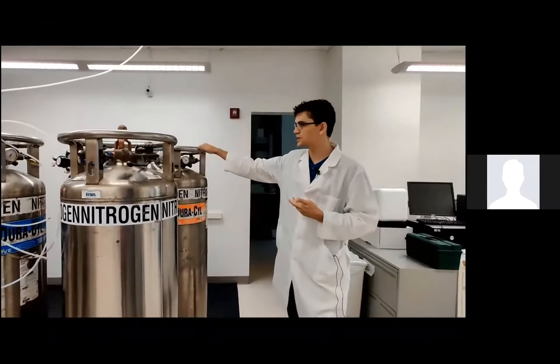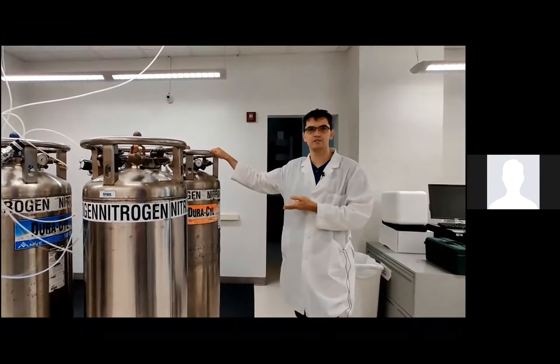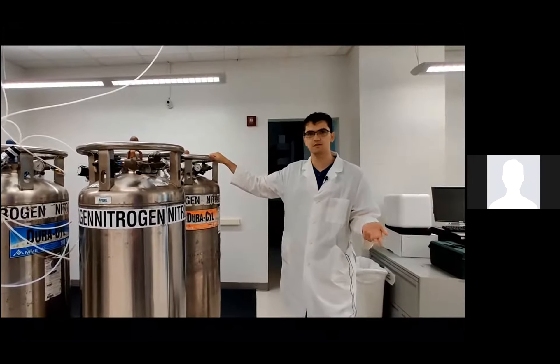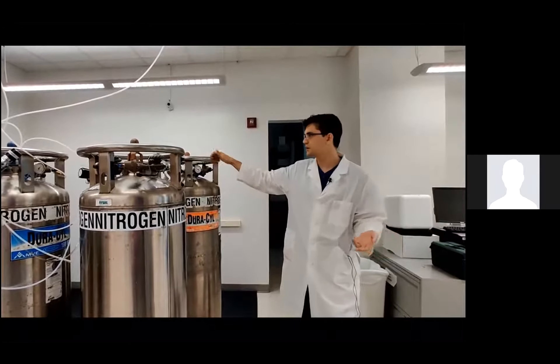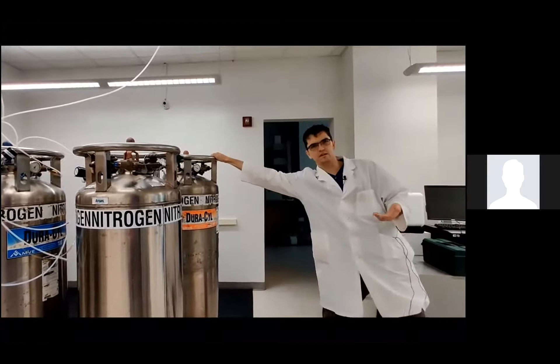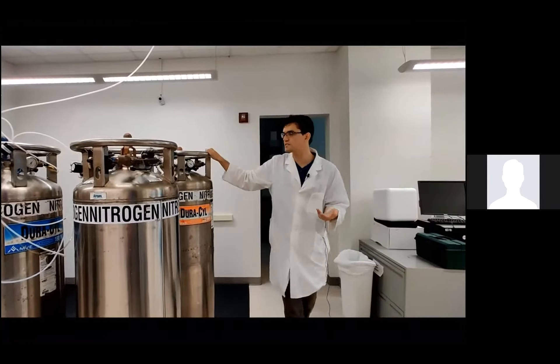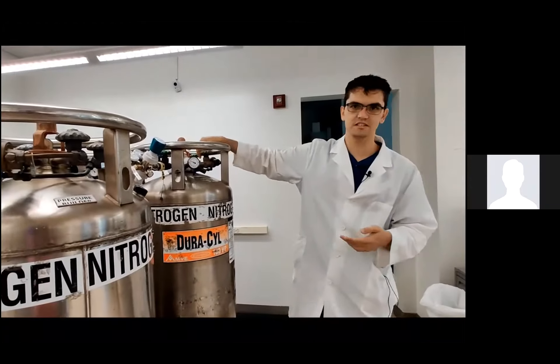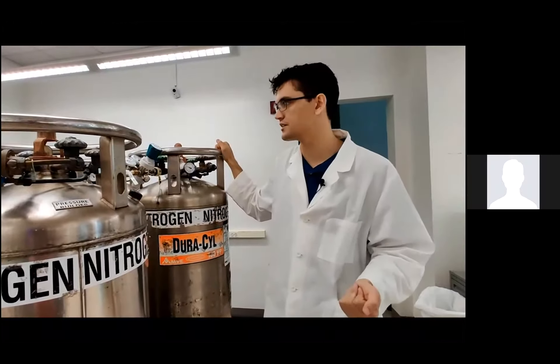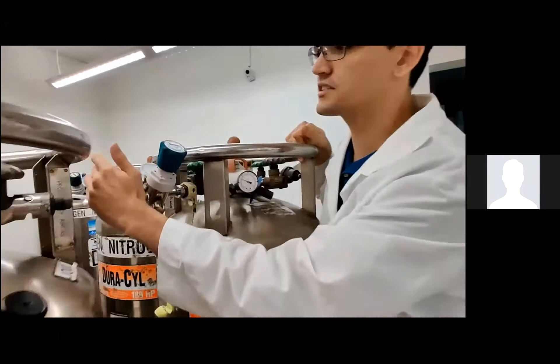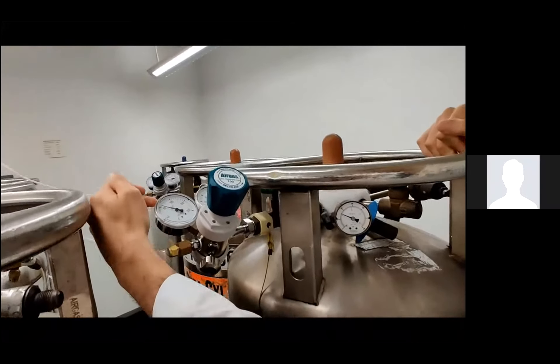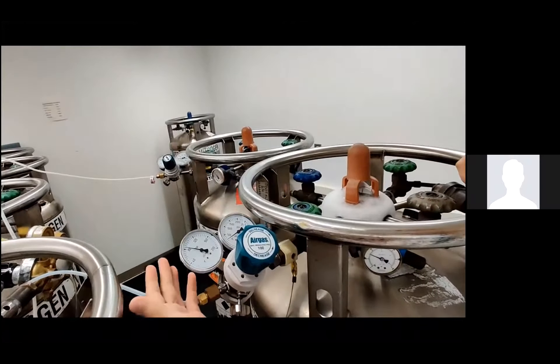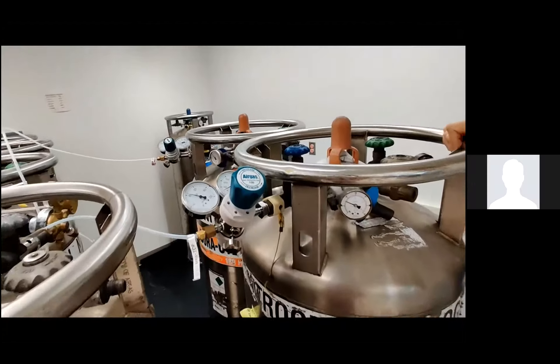So the first thing I need to do is just check that I have enough nitrogen gas for the length of mass spectrometry run that I plan to do. I just do this by seeing how much the tank weighs, since unfortunately it's pretty hard to tell using these gauges how much gas is actually in there. And next, I just need to check that I have 85 psi on this gauge, which I do. That's what the Timstof needs.